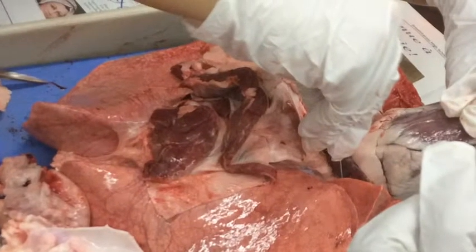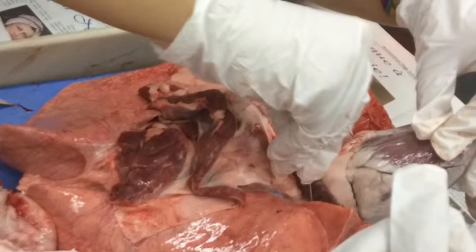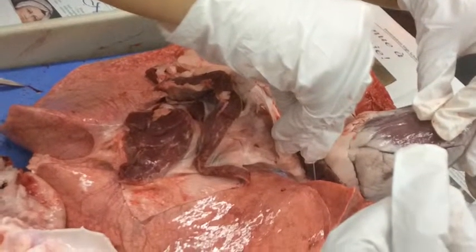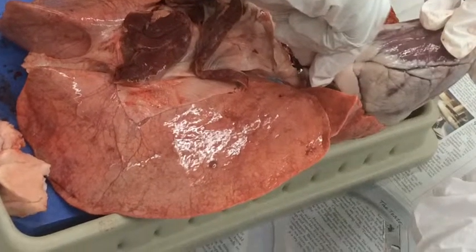Yes, we did have a pericardium membrane and it is present around the heart. Here we are removing it — it looks sort of like fat, but we were able to remove it. It keeps the heart contained in the chest cavity and keeps the heart from over-expanding when the blood volume increases.